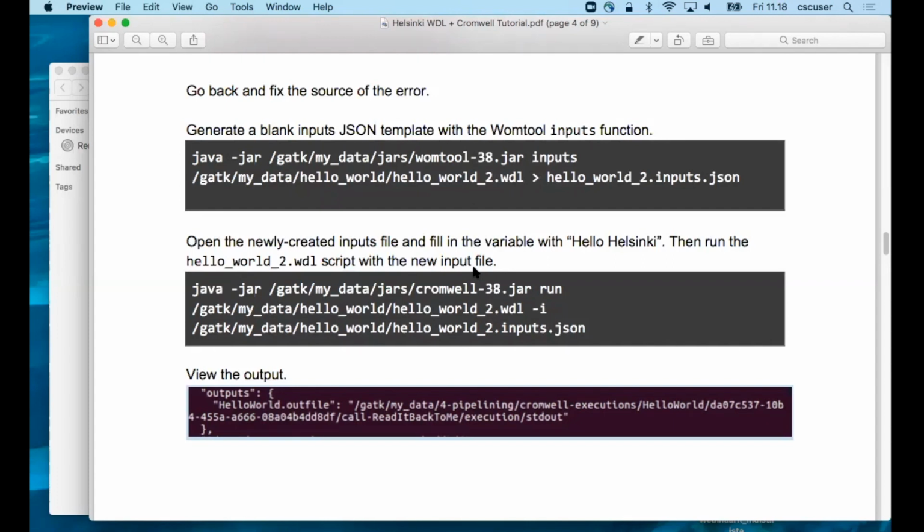The fifth section of this is to run a GATK command. I'll show you how to name different files and input that in a GATK command.